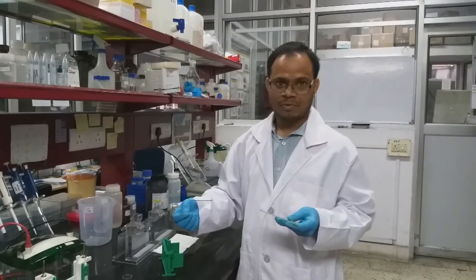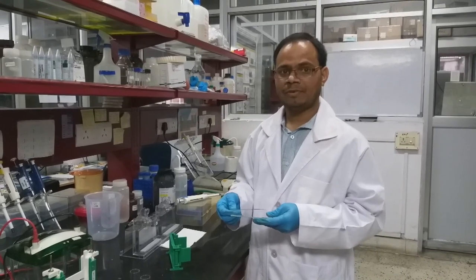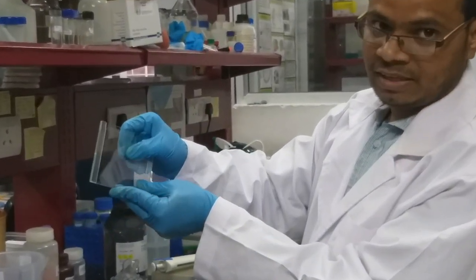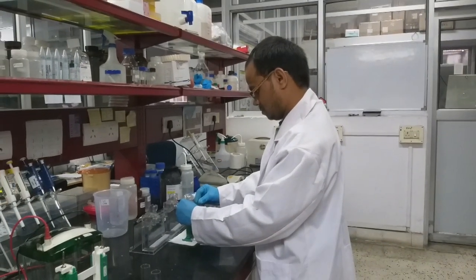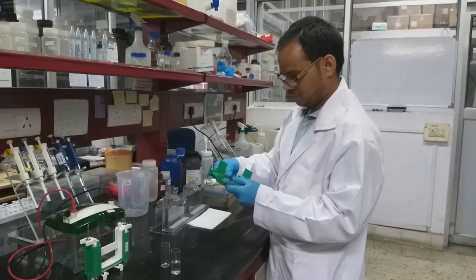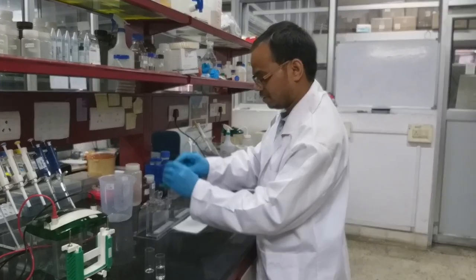If your loading solution is less, like you want to load only 20 microliter or 30 microliter, then a 1 mm gel is good enough. But if you have extended volumes like 70 microliter, you can use 1.5 mm. You have to arrange like this, short plates on this plate, and the bottoms should be equal. Then we have to put it in this tray. Then we are going to keep it like this.